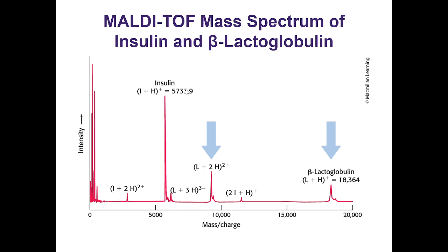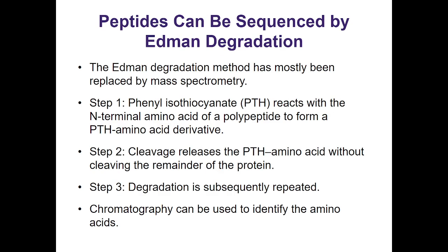Okay. And that gives that mass over charge ratio right there, right? Its mass essentially being +1, right? Note that you do very oftentimes get the additional plus hydrogens coming on these things. They're fairly large molecules. And so you do have to watch out for these small peaks with the additional hydrogens. Very common. Okay? But your primary peaks are typically just going to be 1 hydrogen for most things.